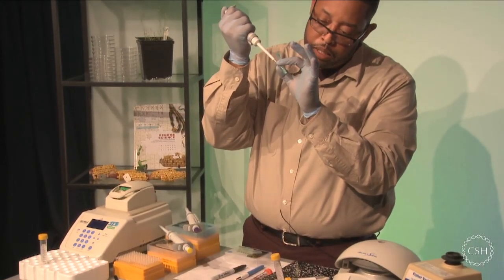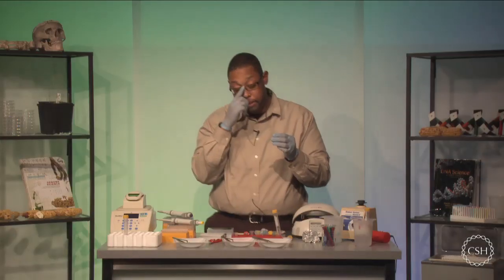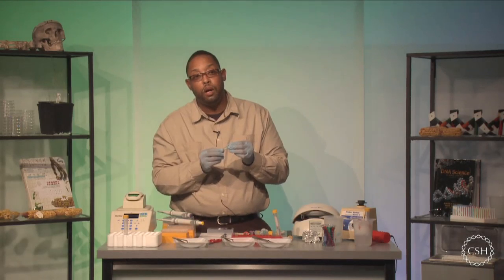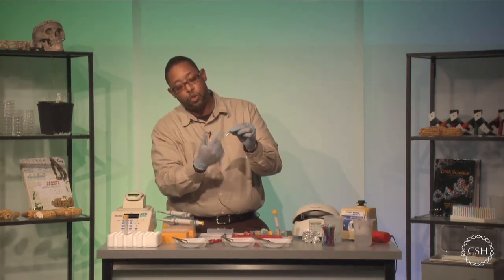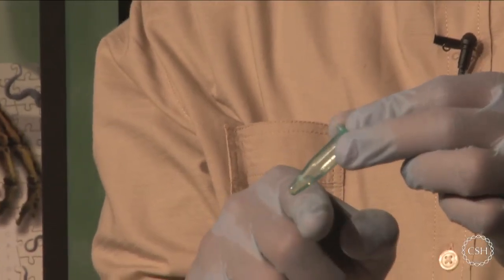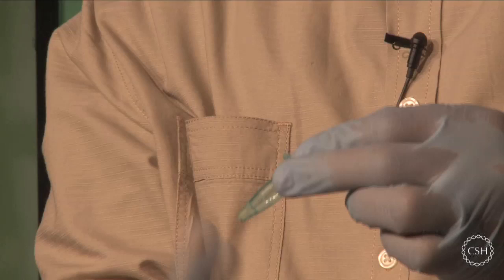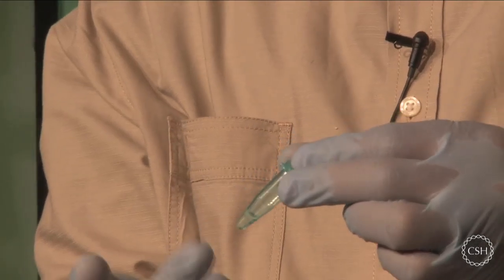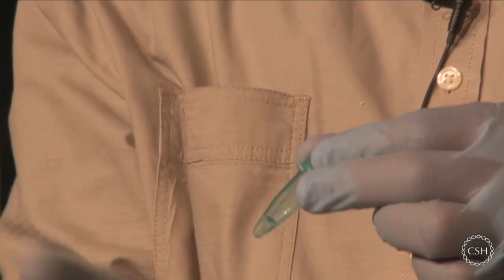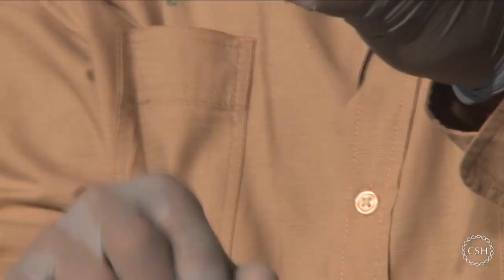All right, so that's the last test tube. What I want to make sure is that the silica resin actually gets mixed rather well with the supernatant, not the tissue. The idea is that the silica resin is just going to float around in there. But I want to make sure it evenly distributes across the sample set, because there's a lot of resin inside of here. So what I want the sample to do is to turn from this clear lysate to a cloudy solution. So I'm just going to finger vortex here.